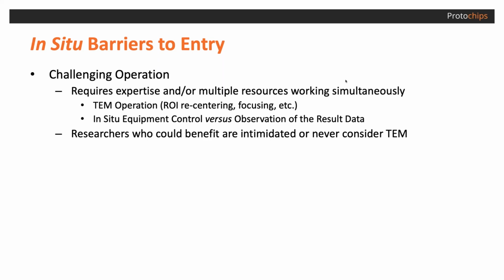And that's where the TEM operator comes in. They've got to constantly be repositioning, recentering the area of interest. And at the same time, since it doesn't move in just X and Y, it moves in 3 dimensions, the operator's got to simultaneously be maintaining focus of the area. And these experiments don't go for a fraction of a second or a few second exposure. Typically, they go for minutes and hours. Some are extremely lengthy as you exercise the entire reaction or the entire experiment. So this is a tedious operation that takes skill and muscle memory and can be quite daunting for somebody who's not used to it. But yet, many people do in situ experiments, and that community is growing constantly.